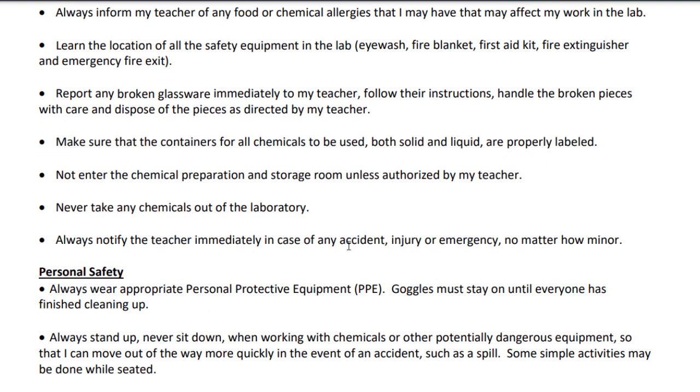Let me know if there's any kind of an accident, injury, or emergency. This one is a test question, so make sure you remember that it's no matter how minor you think it is, okay? You are not qualified to know whether something is major or minor because you don't know what other substances have been in the room. You don't know what the other class before us might have been using, a certain chemical that suddenly, if you get a paper cut, can get into you and cause you some damage. So just let me know. Even if it's minor, I'll let you know whether it's major or minor, and we can get that sorted. So anything that happens, accident, injury, or emergency, let me know. Please, please, please. We'll keep everybody safe in here.